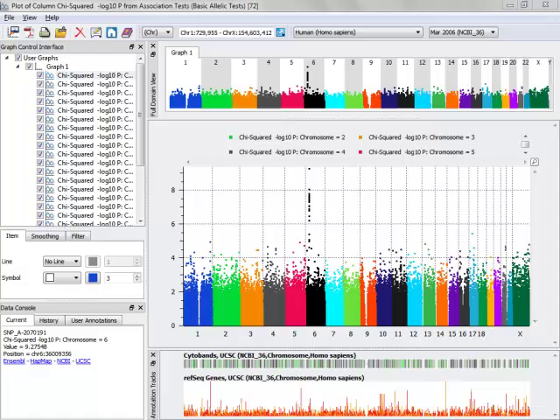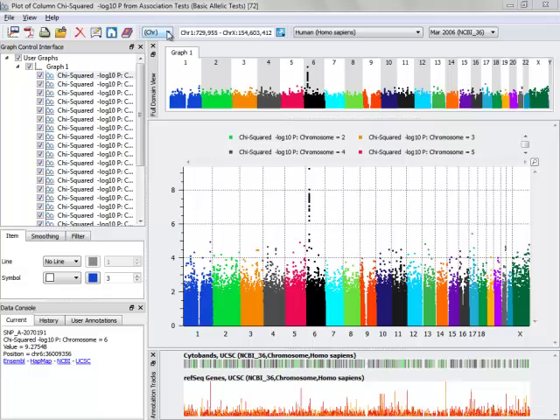So now that I've got my Manhattan plot, I want to go ahead and zoom in and investigate my most significant regions a little bit more. I can do that by left-clicking and dragging anywhere on the plot, or by double-clicking on the 6 in the full domain view, or I can even go in and click the drop-down button and click chromosome 6.